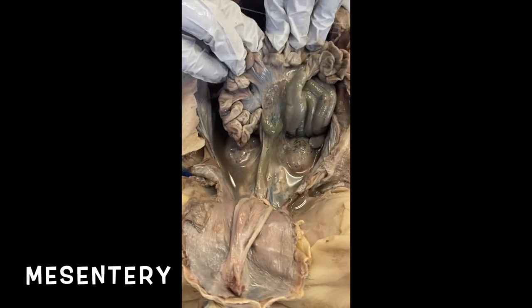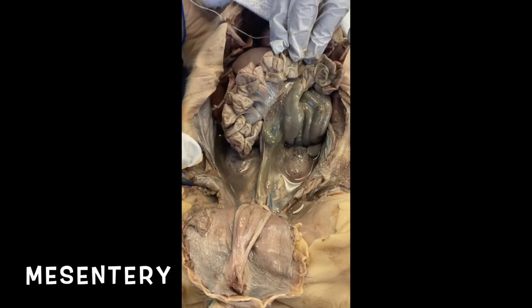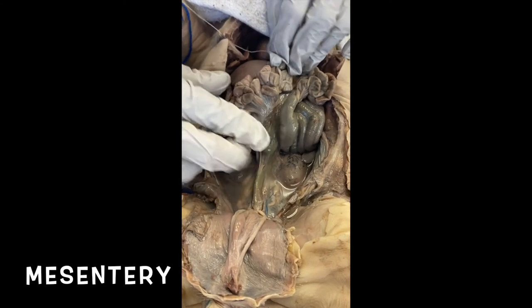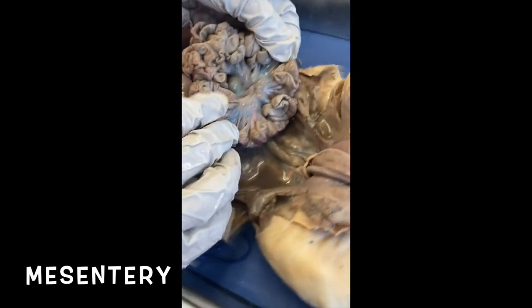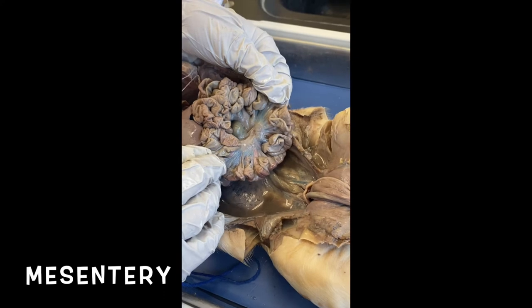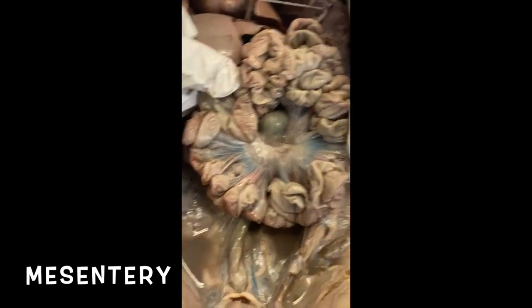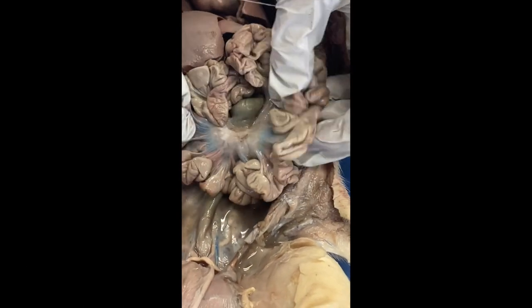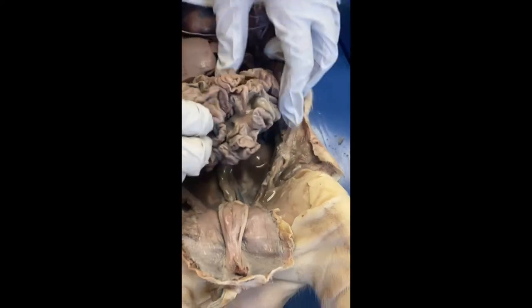So if you look at this connective tissue, it bands your intestines together and keeps them so that literally they're not flopping all around. And I can find them again here. Look at that shot. Beautiful. We got red for arteries, pink there, and some blue for your veins, and it's going to keep your intestines intact. And it almost looks like coral. Absolutely. All right, I think we're good for that segment.